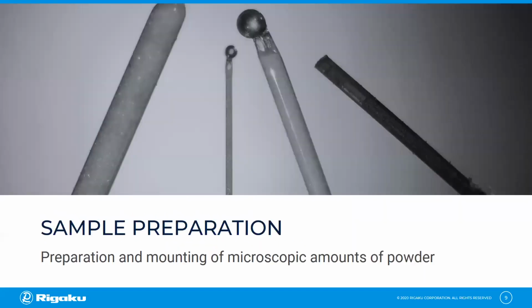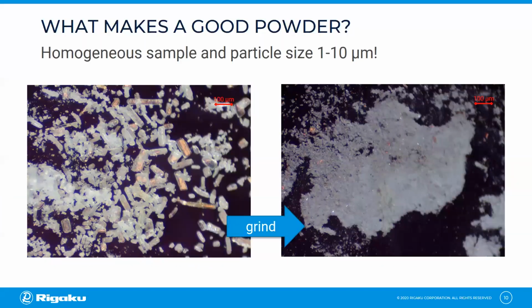But today we will focus on the collection of powder data for quantitative analysis, and we will start with the sample preparation. Most sample preparations will be performed under the microscope, which will be present in most single crystal laboratories anyway. Here we can get a good estimation of the crystallite size.